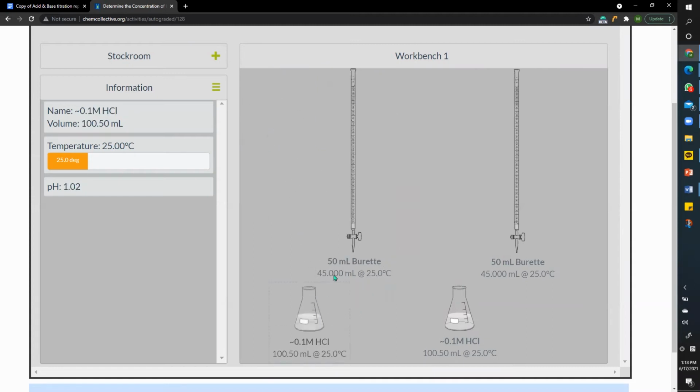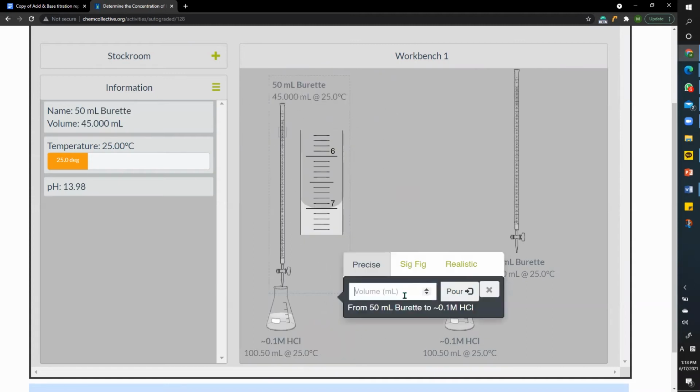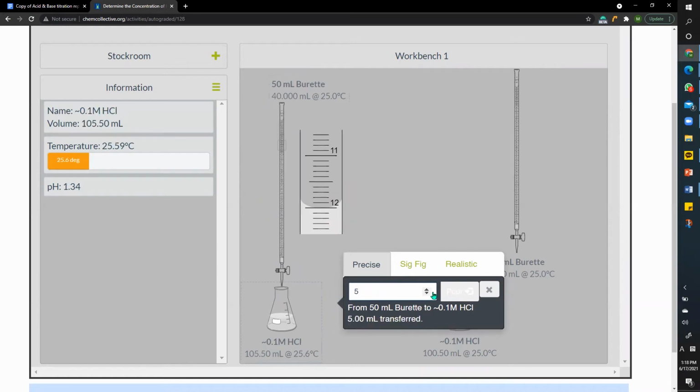If you don't want to do this, just click 0 point. You just type here and click the pour. It may take more time or less time, not sure. First, I will add 5. And then from here, I will add 0.1. So let me see when this color changes. Should be really careful and concentrate, okay?